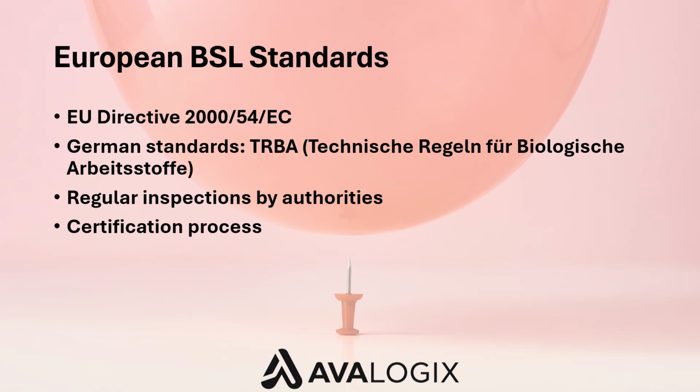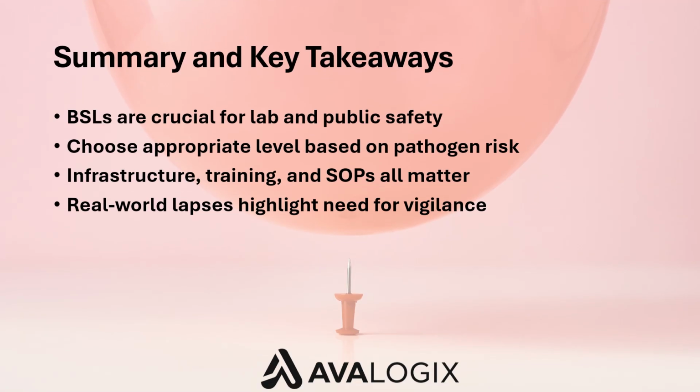Laboratories are regularly inspected, and certifications must be updated periodically, especially for BSL 3 and BSL 4 facilities. If you're planning a career in clinical diagnostics, biotech, or academic research, understanding these standards is vital. It also helps you align your lab's practices with both national and EU legislation, reducing the risk of both accidents and legal noncompliance. Let me summarize the key points from today's lecture.